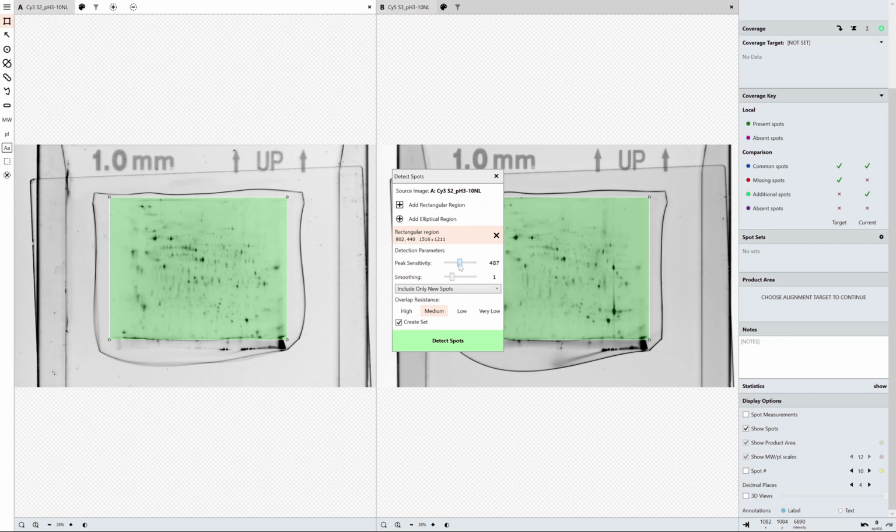People often come to me and say, what should I use? What numbers should I use? Can you please tell me what numbers to put into this for my experiment? It's basically impossible for me to give you a number from my side, without having worked with or seen your images, to know what's going to work for you. So it's something the customer has to do on their side and calibrate for their images.